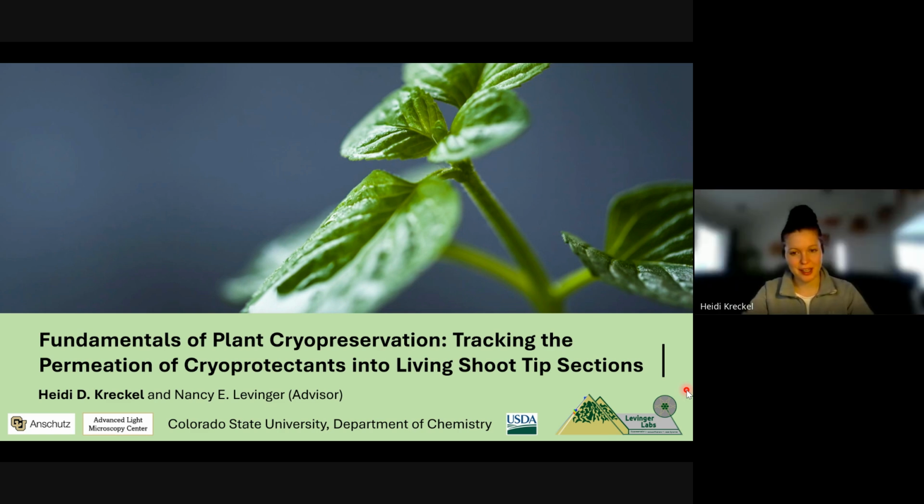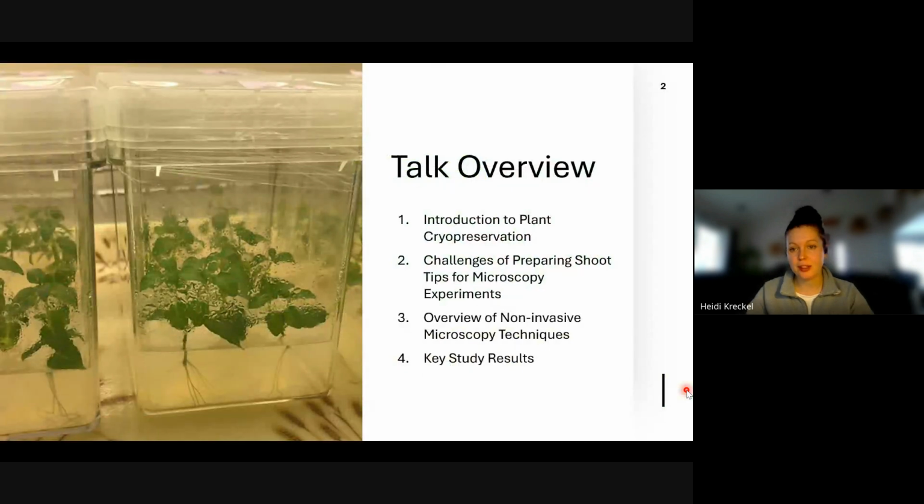Thank you so much, Abby, and thank you for inviting me. So today I'm going to be talking about some fundamentals of plant cryopreservation and tracking the permeation of cryoprotectants into living plant or living shoot tip sections. But I want to start with a brief talk overview as we'll be navigating quite a bit of information today. So really, I'm going to begin with an introduction of plant cryopreservation and why we actually should care about cryopreservation and why it's become incredibly important.